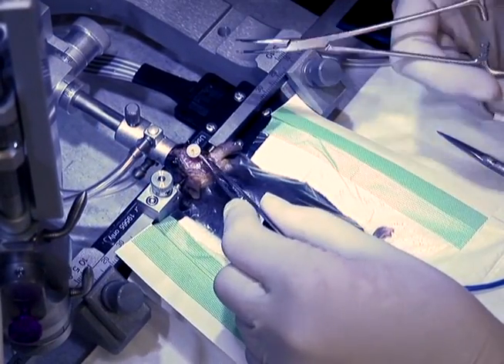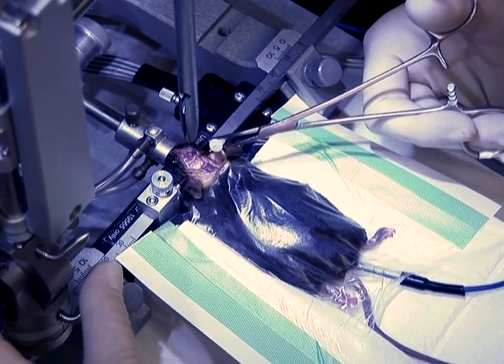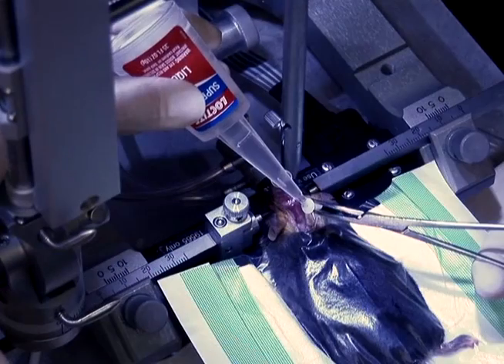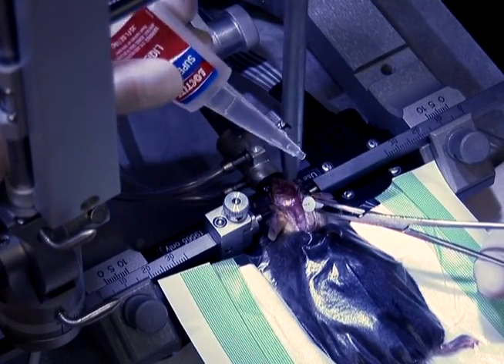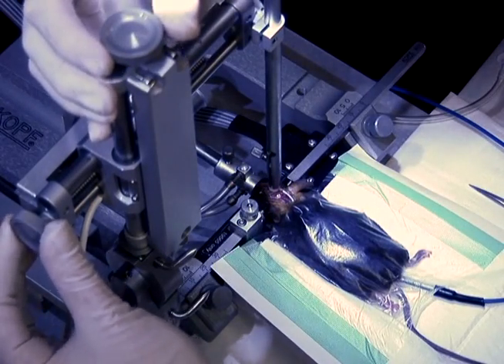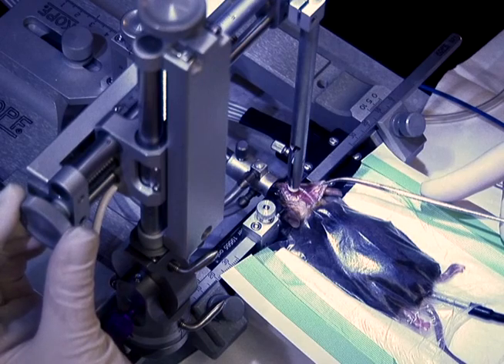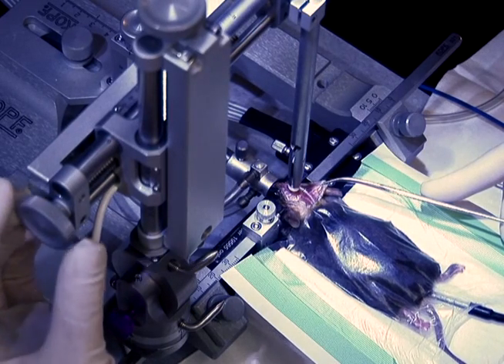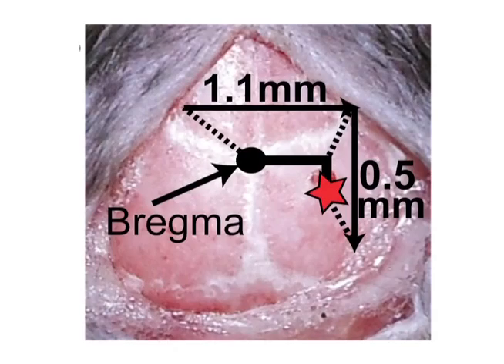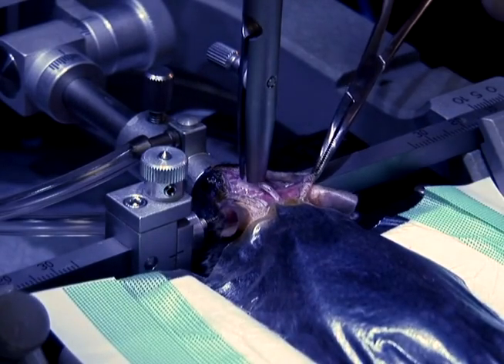With the curved hemostat, grab the cannula at the groove where the top meets the pedestal. Move the cannula driver into position and secure into place. Then, place a single drop of super glue on the base of the cannula and push the top of the cannula into the driver, positioning it so that the tubing is pointed straight back. Working quickly, touch the catheter tip to bregma and zero the coordinates on the digital display. While holding the skin out of the way with the curved hemostat, raise the catheter and move it 1.1 millimeters laterally to the right and 0.5 millimeters in the posterior direction as indicated on the diagram.